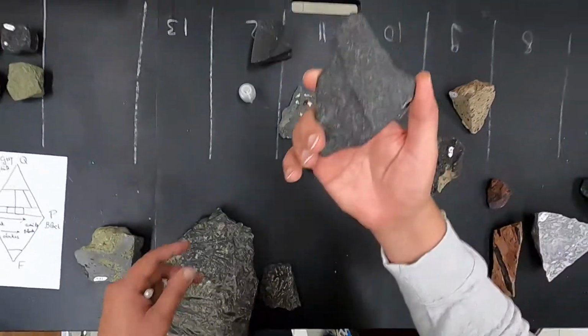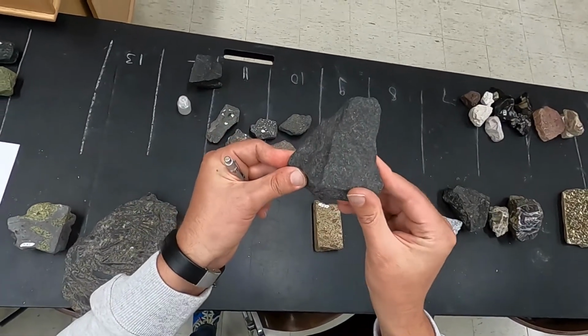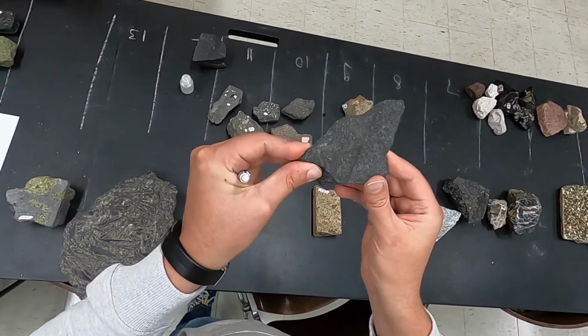And the same is true for this specimen in here. I don't really see a lot of crystals in here.